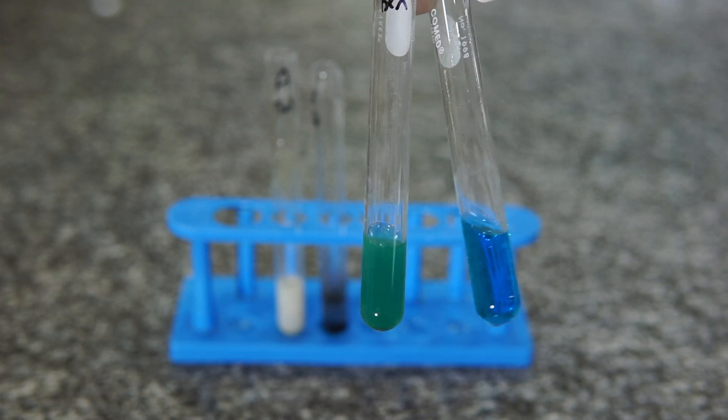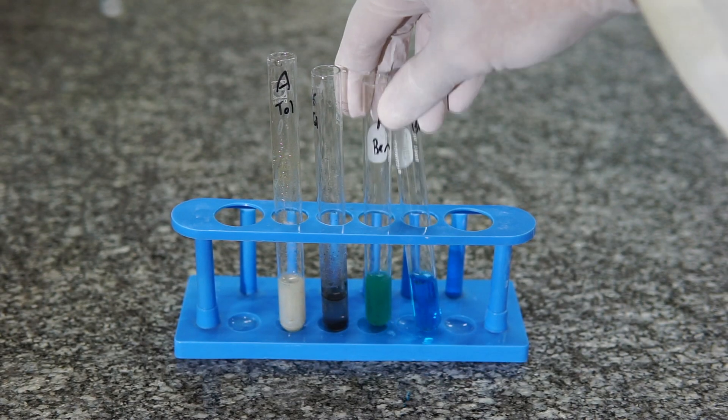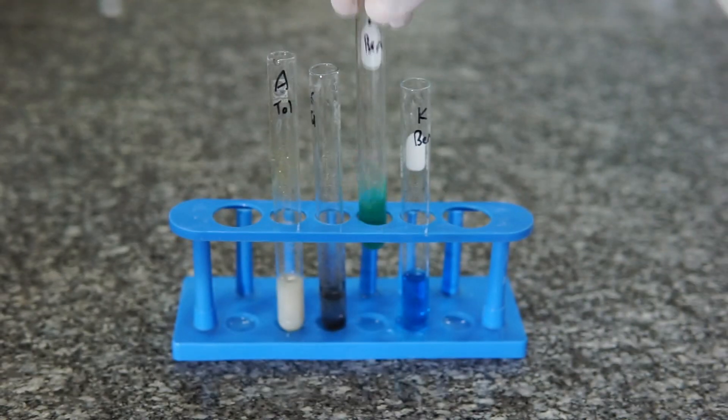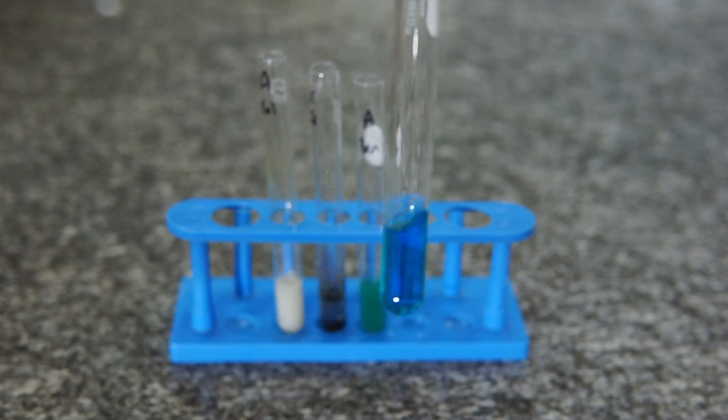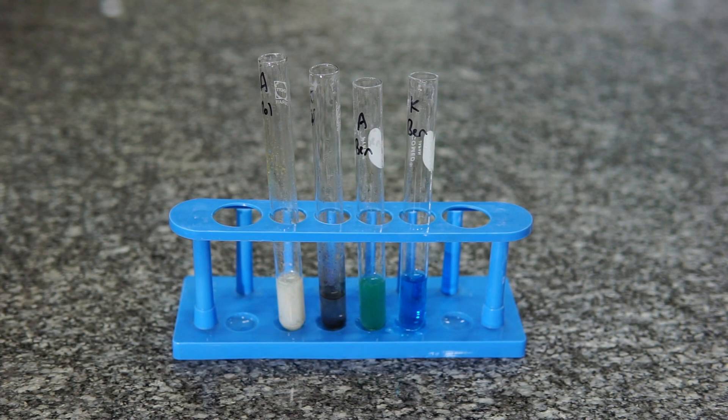And here at the end you can see an example from last year of a proper copper mirror which showed up in one of the test tubes, and also the kind of silver mirror we might expect to get.